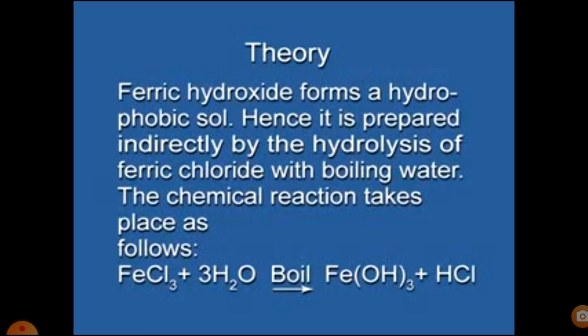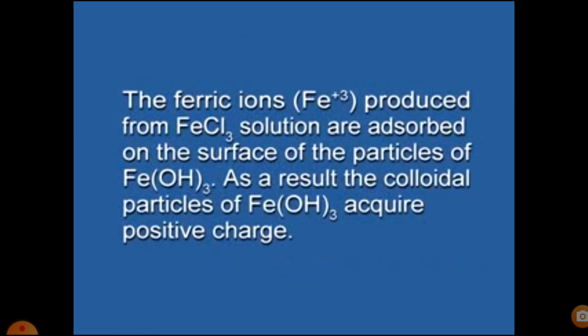The chemical reaction takes place as shown in the equation. The ferric ions Fe3+ produced from FeCl3 solution are adsorbed on the surface of the particles of ferric hydroxide. As a result, the colloidal particles of ferric hydroxide acquire positive charge.